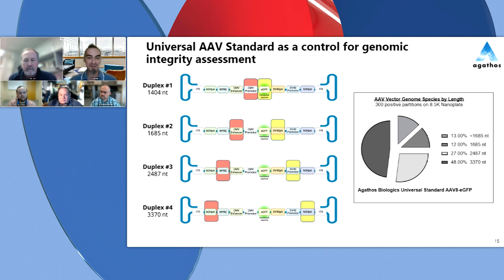And this was difficult to believe, especially if you're seeing that the samples are getting like 95% full from AUC or other full-empty evaluations. So it was difficult then to say whether the assay that we have is really good or not.